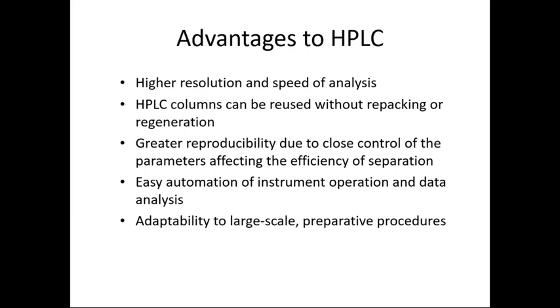There is easy automation of the instrument, where now with the auto sampler, you can just load the samples, ranging from 96 to 384 or more samples in a carousel, and leave. You can come back in the morning and look and analyze the data and set up a new set of analysis.